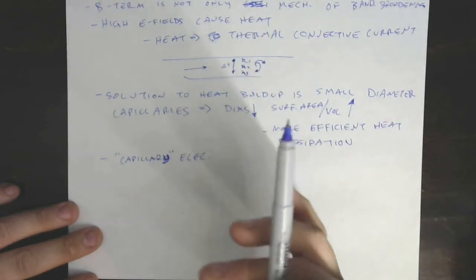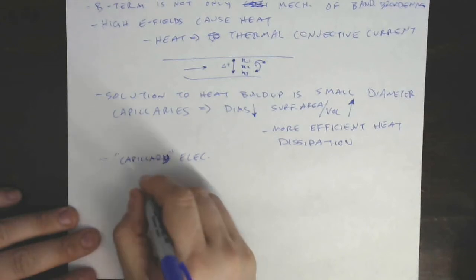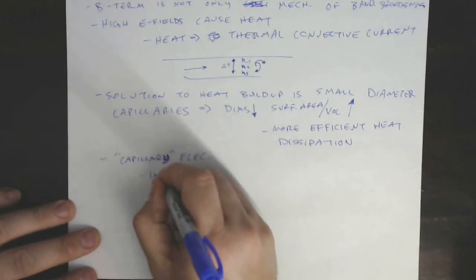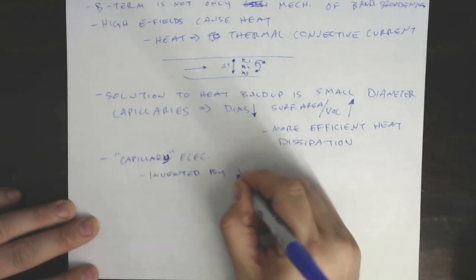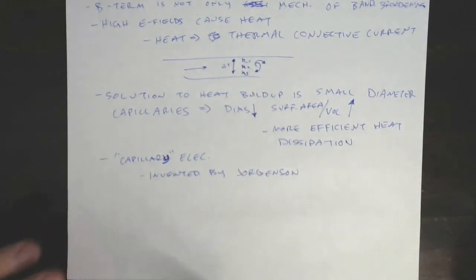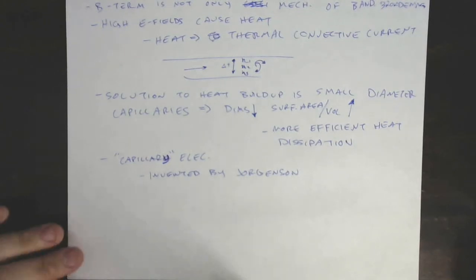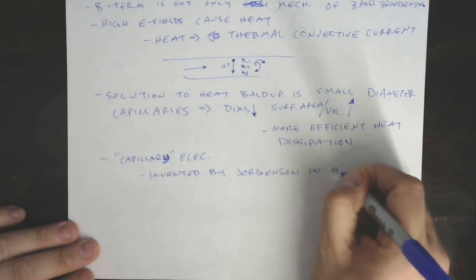And we said the faster the better. And so this really was a revolution in electric field mediated separations. This was invented by Jorgensen. We've heard about him before. Jim Jorgensen at UNC is the guy who got to a million theoretical plates doing some really, really small particle HPLC. He also happened to invent the entire field of capillary electrophoresis in 1981.